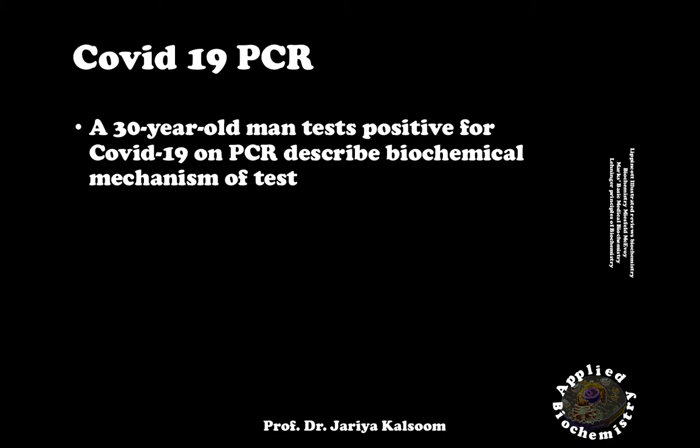The sample for suspected COVID-19 infection is obtained and, after appropriate preparation, it is treated with reverse transcriptase to produce complementary DNA from any RNA in the sample. Complementary DNA is subsequently PCR amplified using primers specific for end sequences of the COVID-19 complementary DNA. The amplified product is quantitated and, with use of a standard curve, it can be related to the original amount of COVID-19 RNA present.